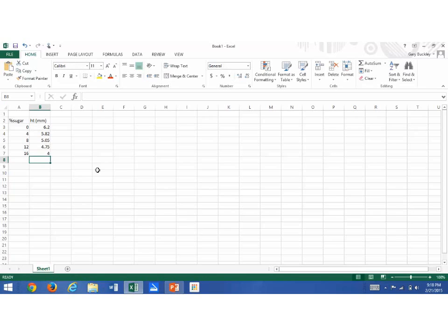Okay, now what we're doing with these data is you're going to do two graphs, one for density and one for the hydrometer. We wanted to have this relationship so that if we know the percent sugar, here's what the height of the hydrometer is floating out of the water. We want to make a calibration plot of those data. We want to show what the hydrometer height looks like as a function of sugar. So when you stick it into your other soft drinks, you can figure out what the percent sugar is based on hydrometer height. It's a very common calibration thing for us. We do something we know, find out what this other variable is, and we take that variable and go back to unknown solutions and figure out what they're going to be.